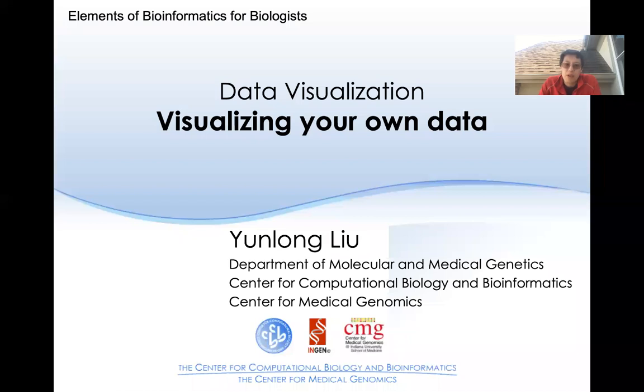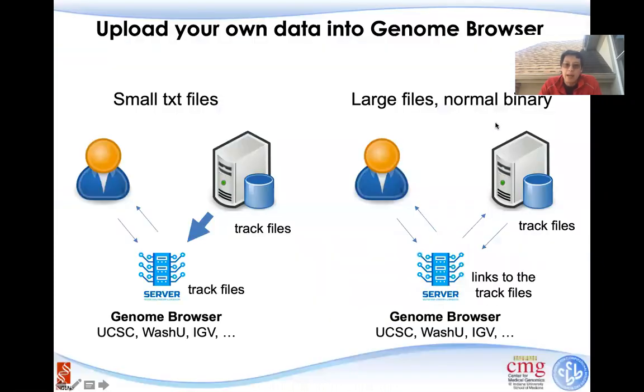In this short module, we are going to go through some of the tricks of using UCSC Genome Browser to visualize your own data. I'm going to give you some hands-on demos so we can see how we are going to operate on this, which is quite a simple and straightforward operation. But before we get into that, I want to briefly introduce some of the theory.